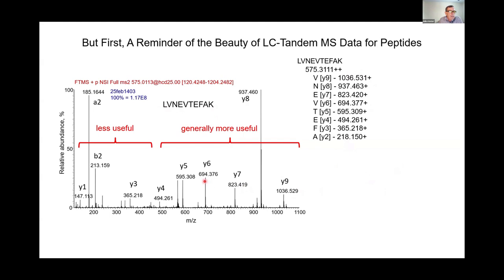Now as we look at the CID spectrum, what we see is essentially the entire amino acid sequence of this peptide revealed. And these are the Y-ions. These are really good for parallel reaction monitoring. B-ions are not very useful. The corresponding B-ion series goes from the N terminus outward, but they all collapse down to B2 and A2 ions, so the high B ions don't really exist.